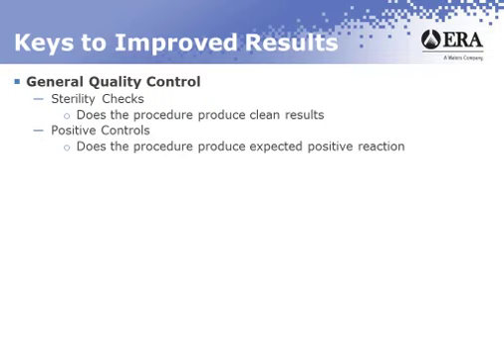You want to make sure that you're not passing that too many times. You can have issues that will come up. So if you can't start with something that is ideally fresh each and every time and perfectly identifiable, traceable reference culture, you just want to remember that that is an issue.